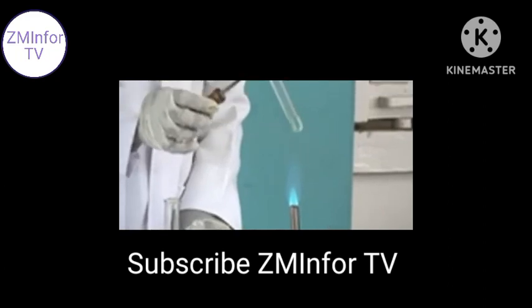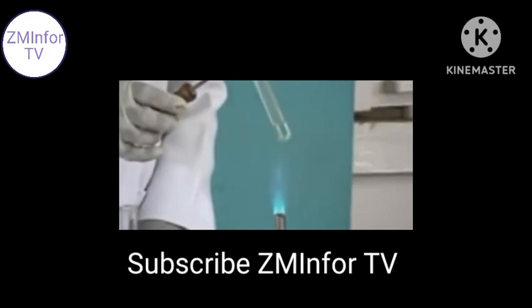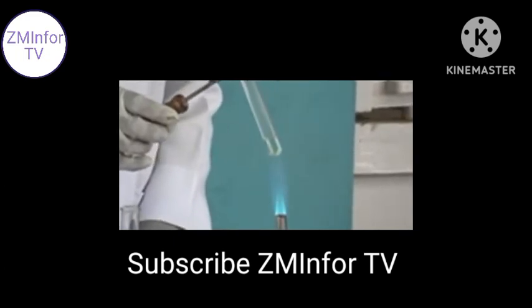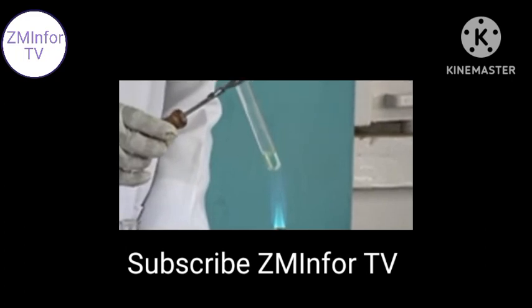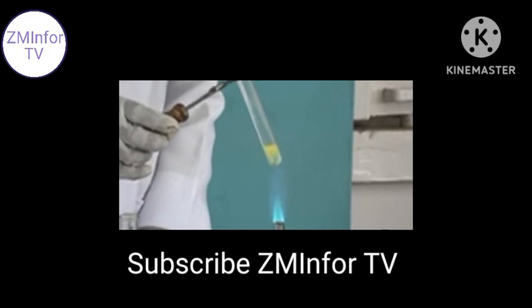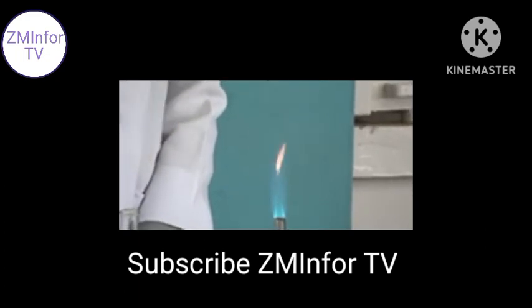Can you see it? As we heat, a brick red or orange precipitate is formed. Can you see?